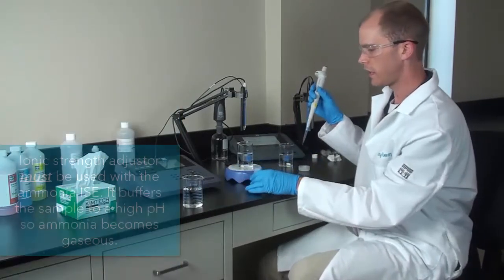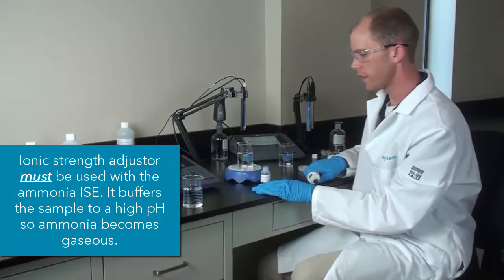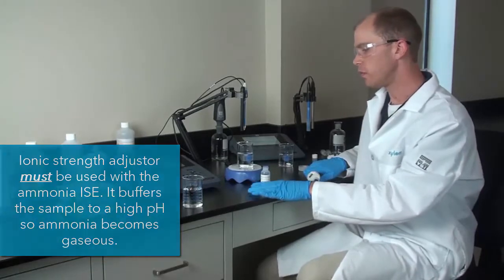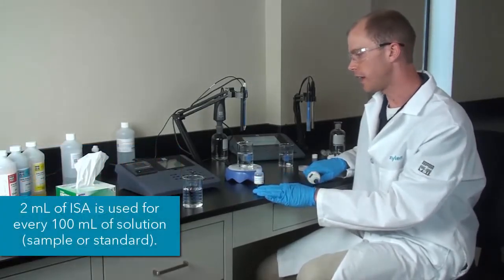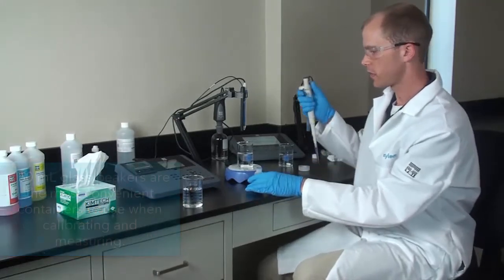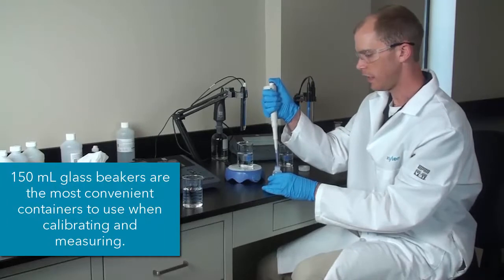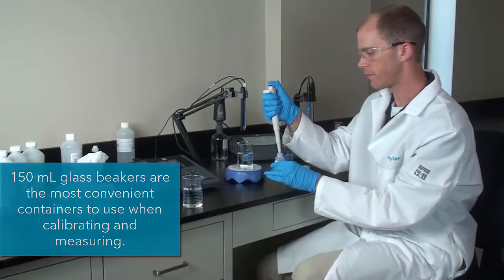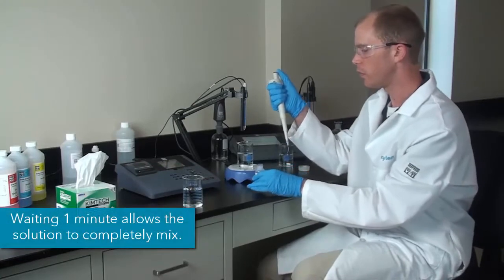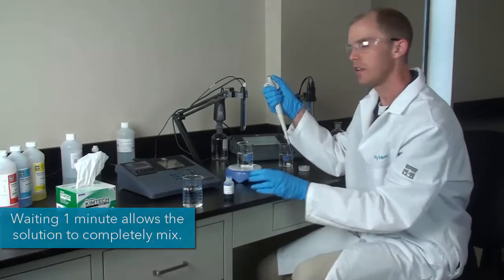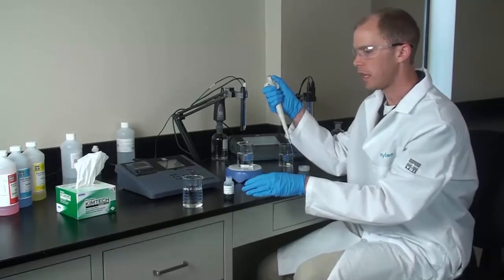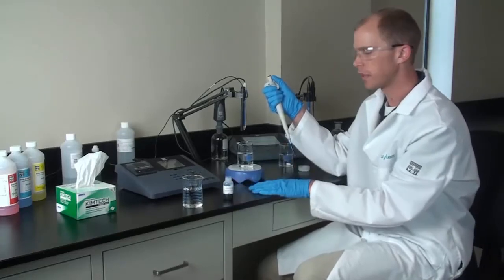So then what we will do is add our ISA. So whether you are calibrating using your standards or you are measuring a sample, you want to add 2 ml of this blue ISA for every 100 ml of solution. So you really need to make sure that your standards and samples are prepared the same way. So what I will do with this is add 2 ml and then I will wait 1 minute after adding it to start my calibration. And that will just ensure that the sample and the blue ISA have mixed well together.